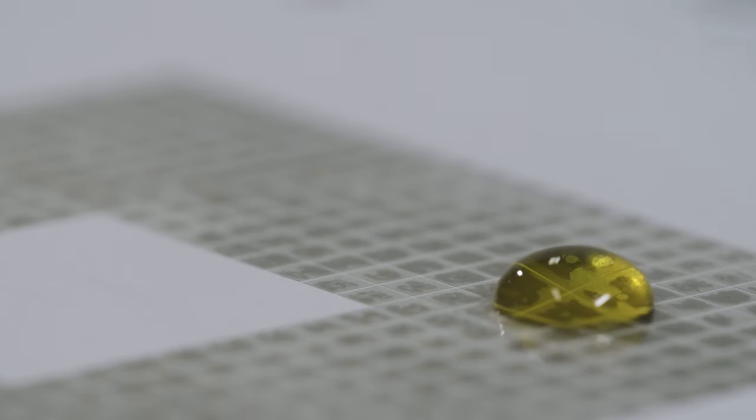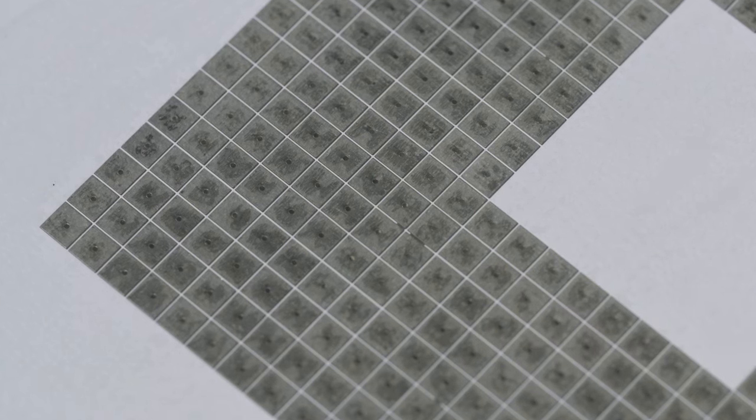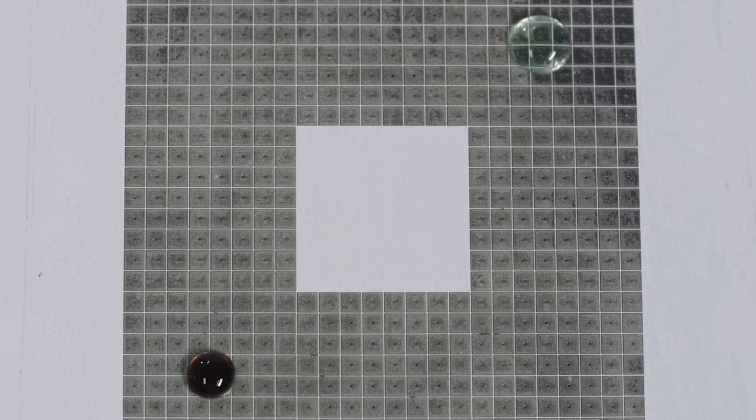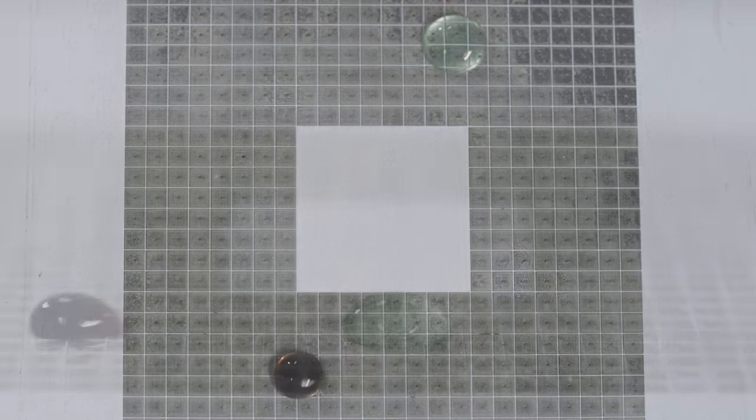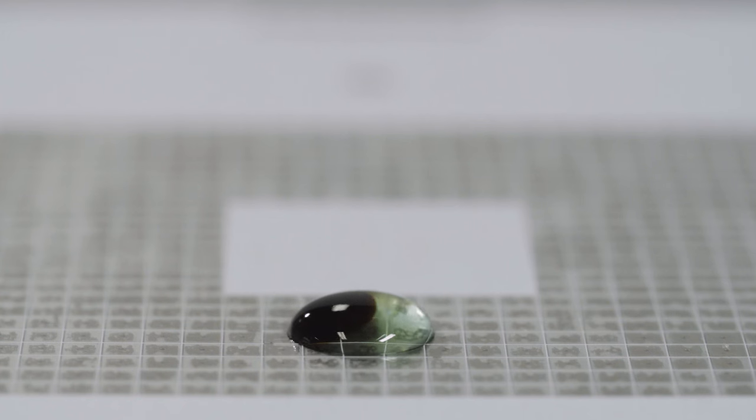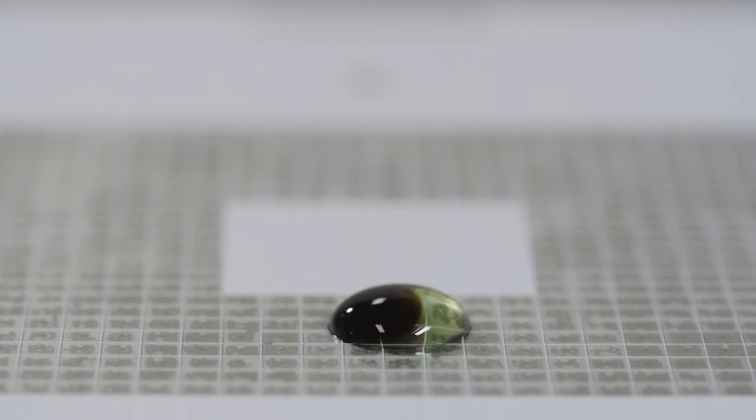So fundamentally, what we are doing in our chip is to charge and discharge tiny metal plates. Charging and discharging of these metal plates attracts and repels tiny droplets. And by sequentially turning on and off these metal electrodes, you can gently shuttle a drop from one location to another.